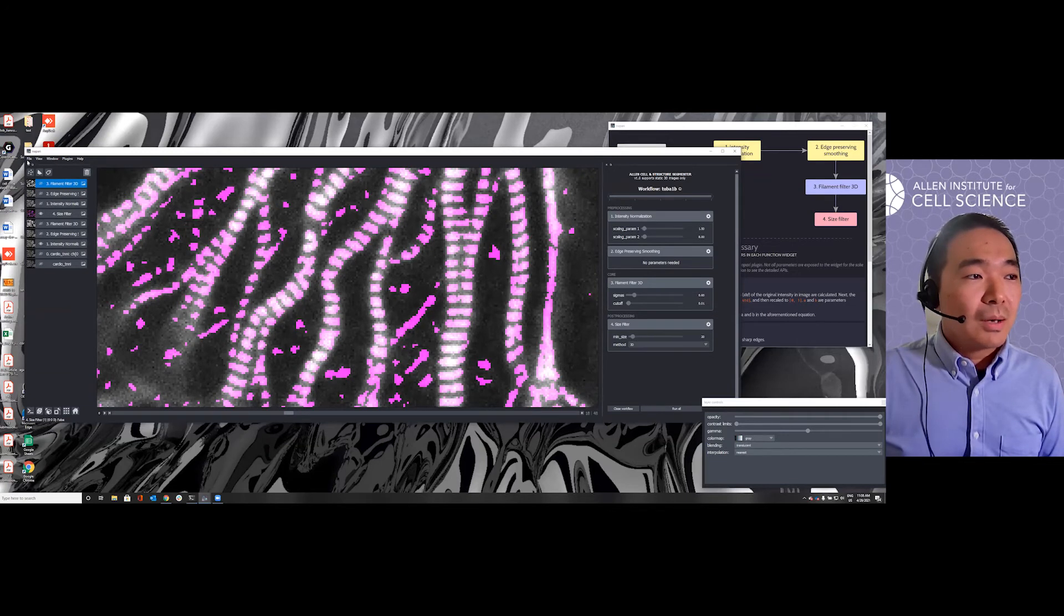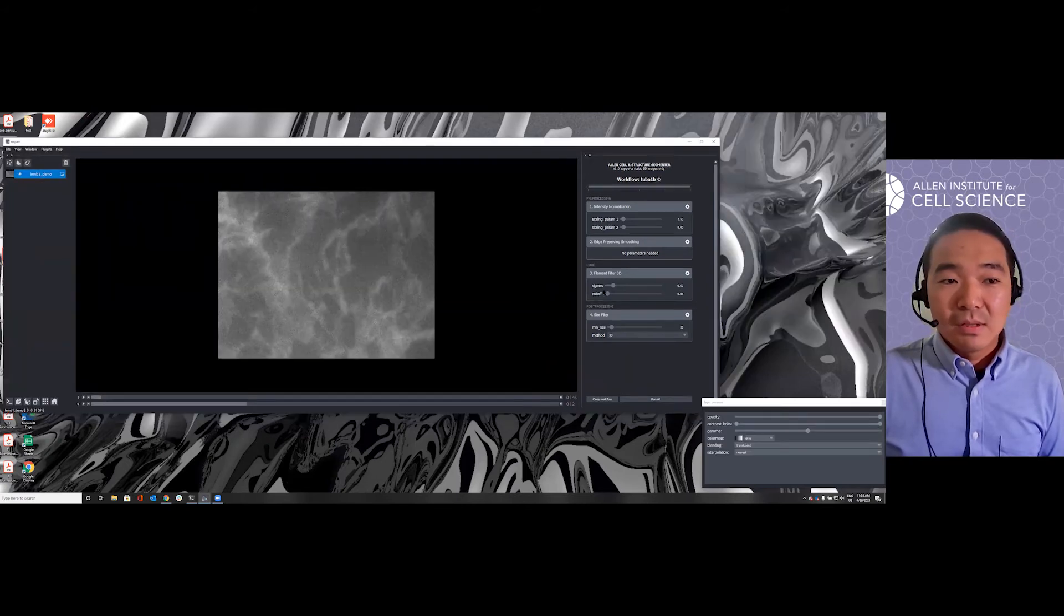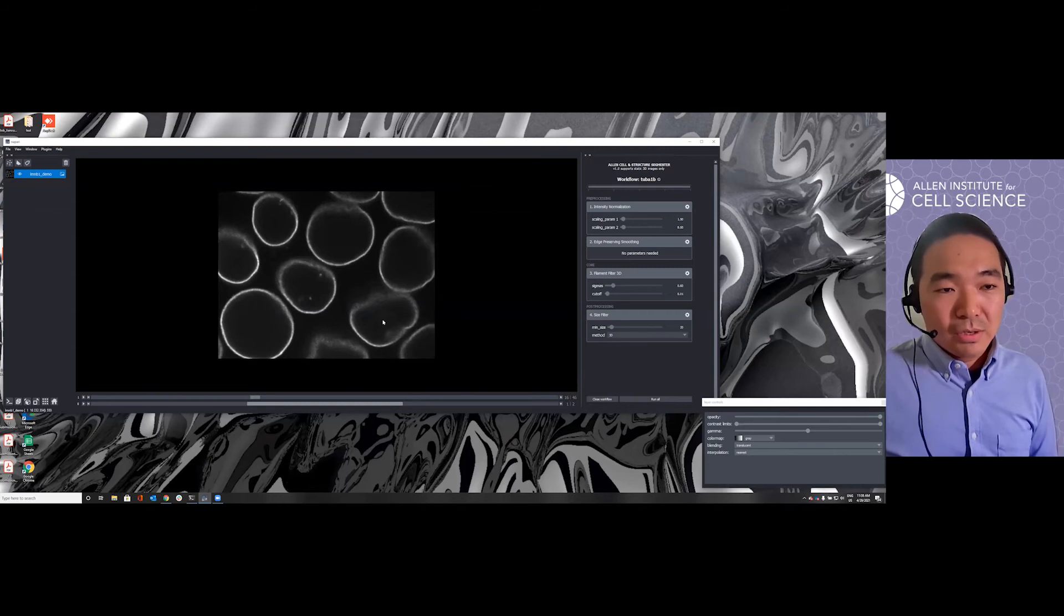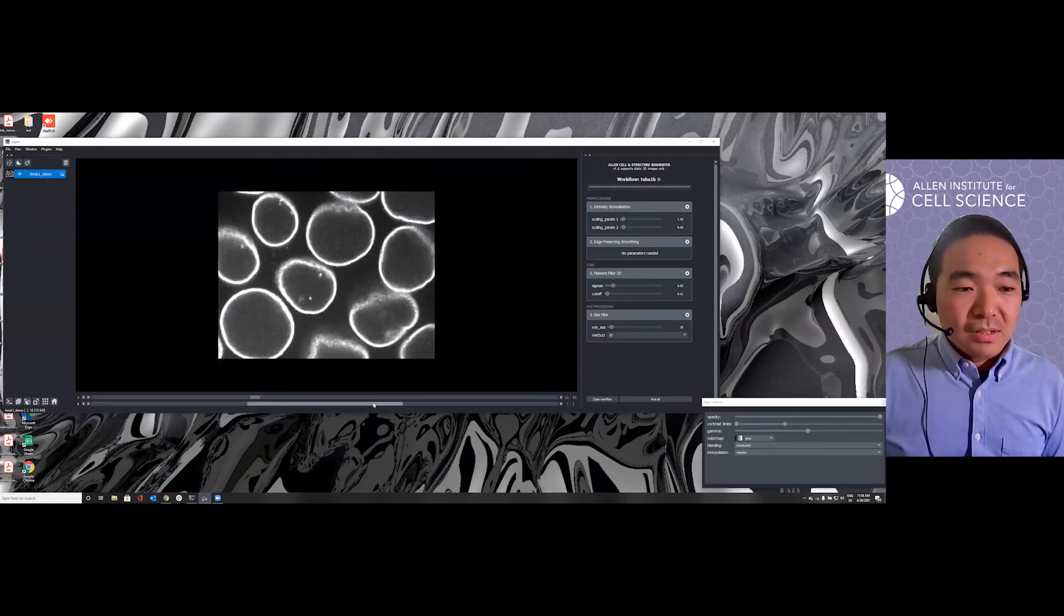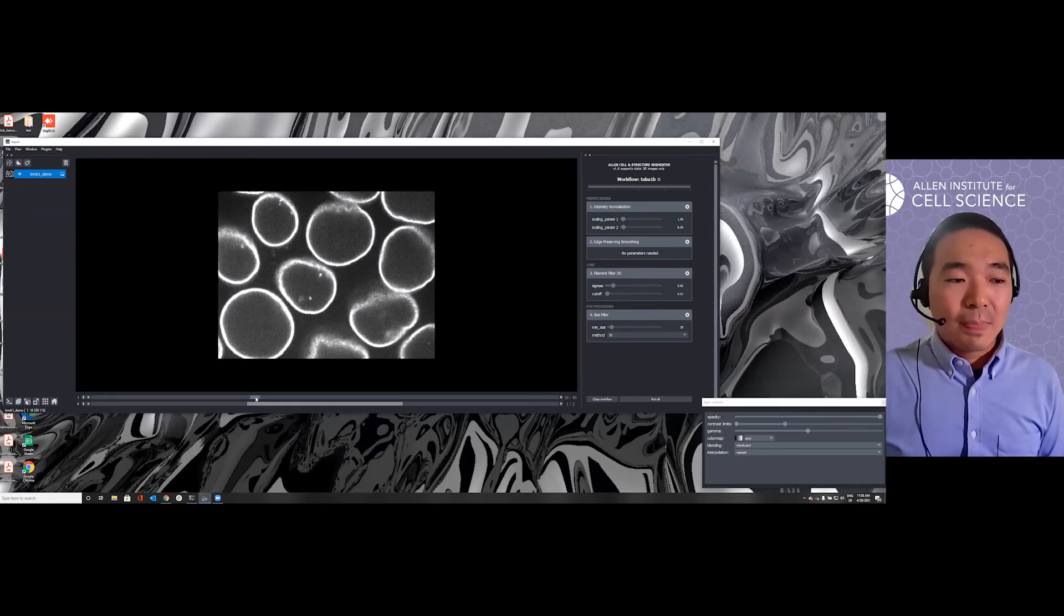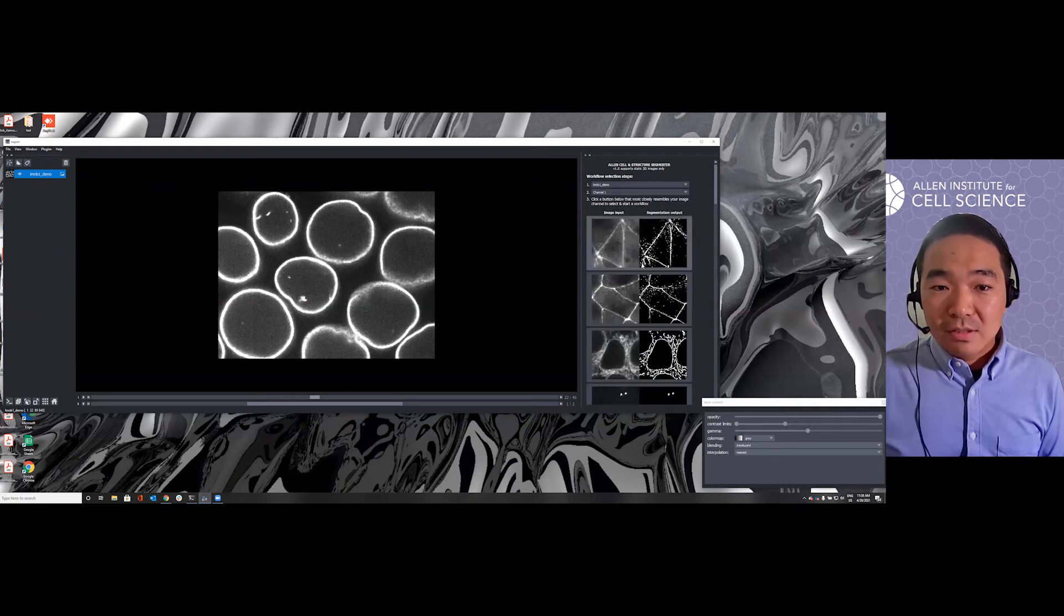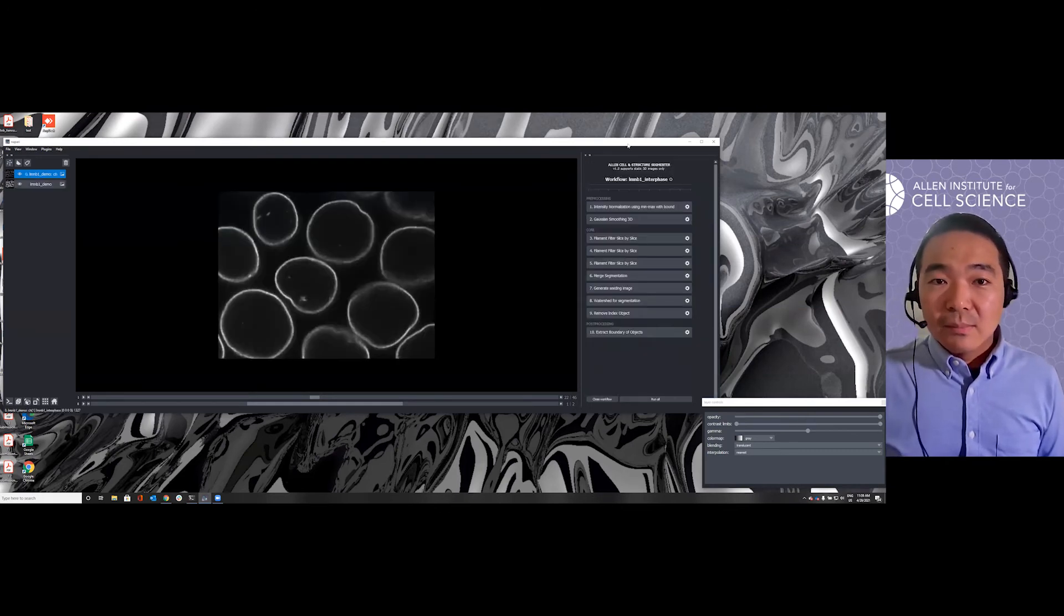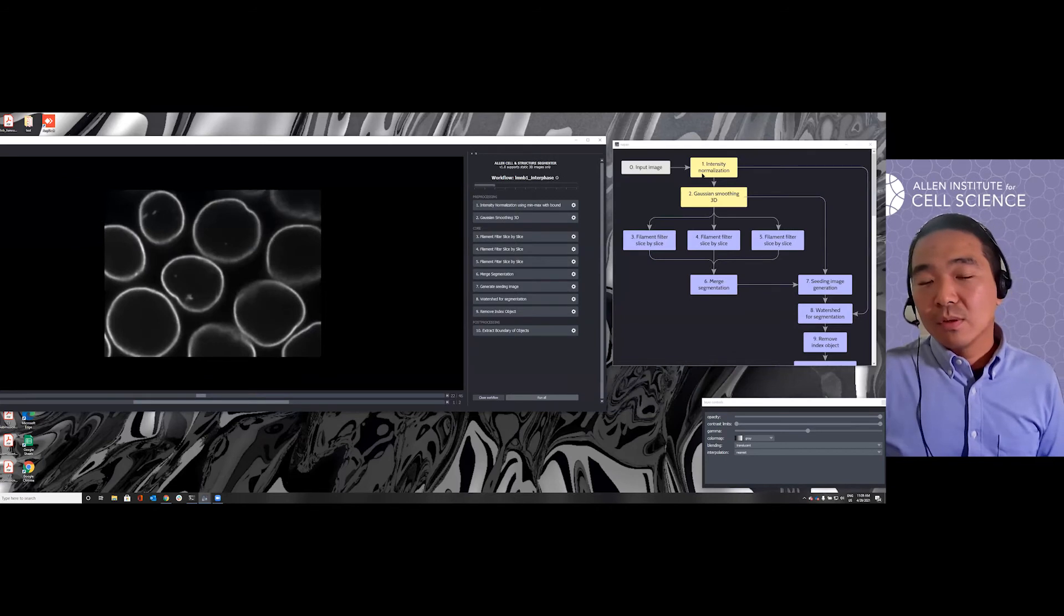This is a relatively simple workflow. Let me pull up another quick example to show something different, which has a little bit more steps. This time I have a multi-channel image where I have the cell membrane channel, the nuclear envelope channel, and the nuclear dye channel. In this case, our target structure is this nuclear envelope, via Lamin B1. As you can see, there are more steps here. Let's keep it running and then we can talk through the workflow.